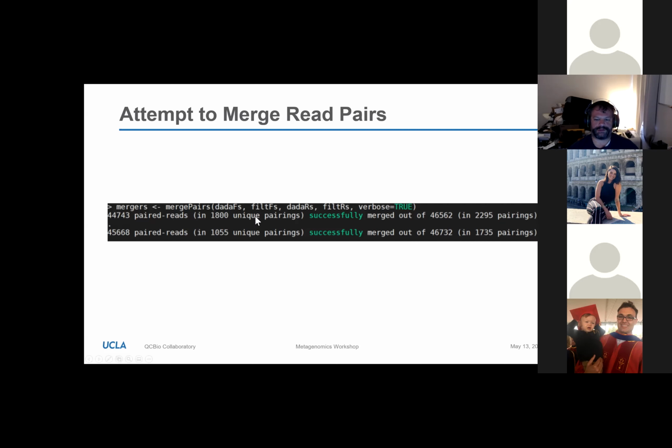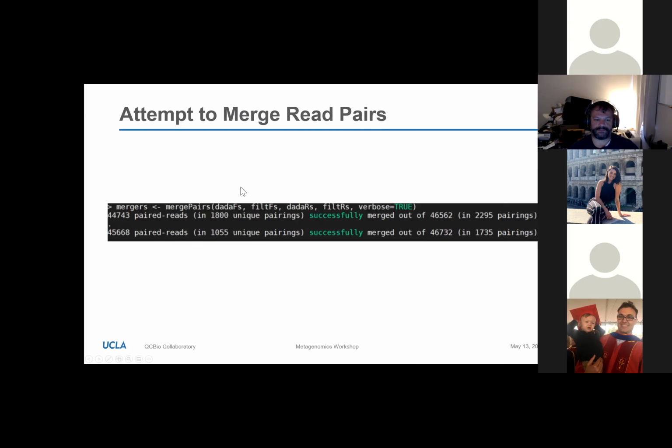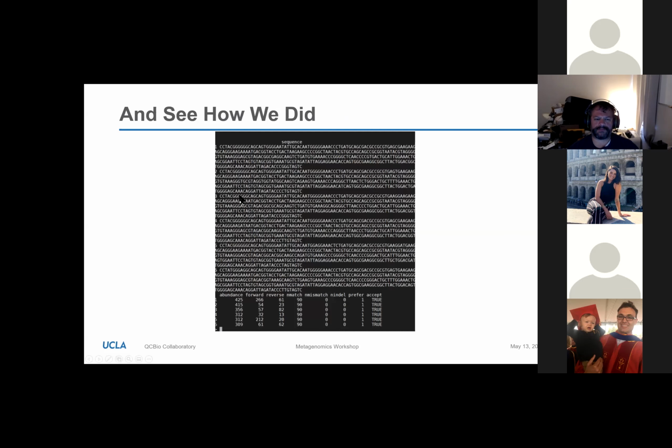All right, so this should have run successfully for people. Like I said, this only takes usually a minute or two to finish. So if you do have a look at what you get out of there, you're going to get this. Well, anyway, if you have a look at what that generated, you'll see that it basically generated a table of sequences that were picked up.